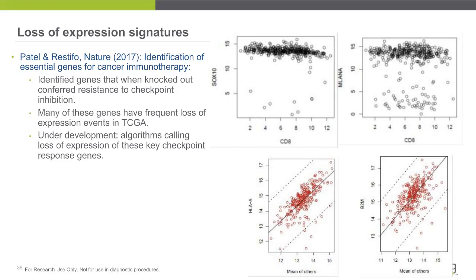So in these cases, it seems like B2M has been drastically downregulated, possibly in an adaptation to help the tumor avoid the immune system. So just another variable that we can use to describe what's happening in the tumor-immune interface using gene expression.